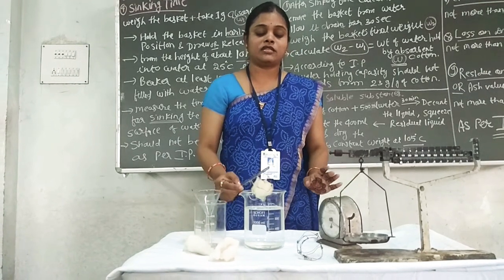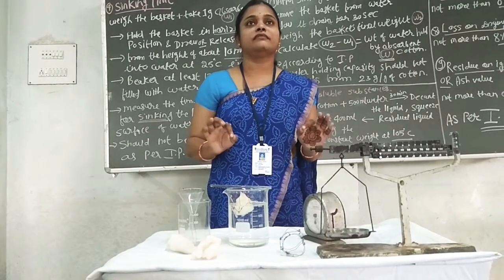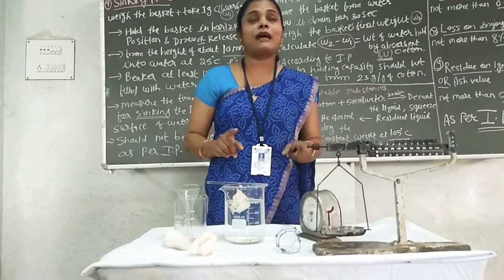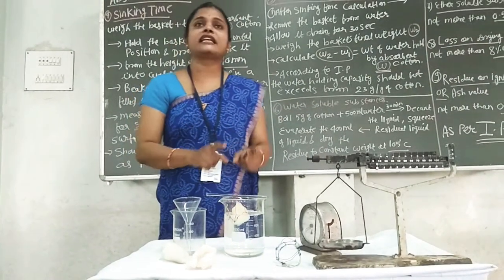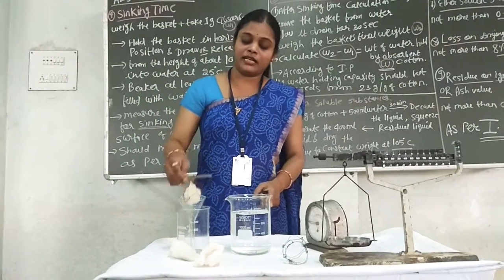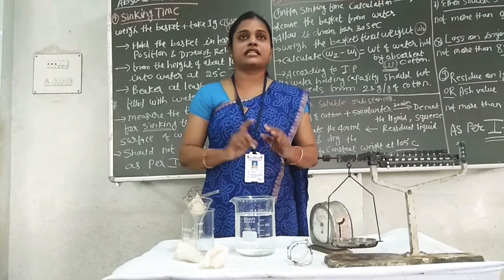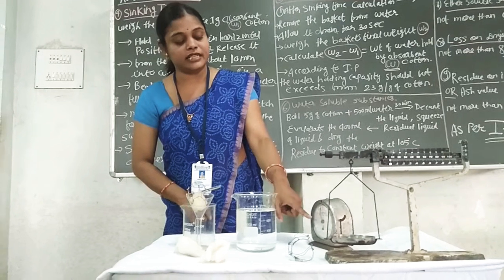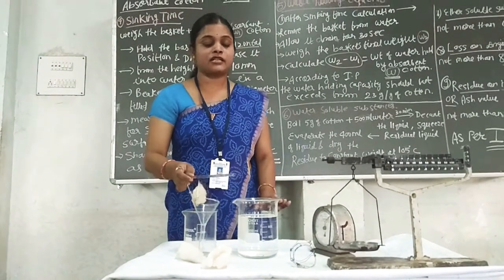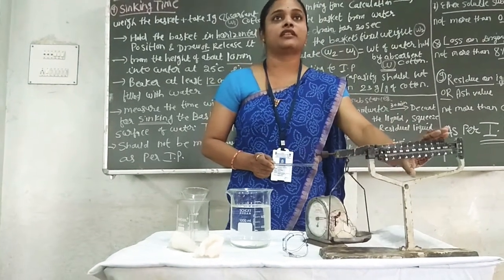For example, I have placed the basket. I will note how much time it takes to sink. This is the sinking time — for example, 10 seconds, 8 seconds, 11 seconds — these are example sinking time values. Now I will show the water holding capacity. I have filled it with water. I will keep it in position for 30 seconds so that the water drains out. After 30 seconds, I take the basket from the water and keep it in the middle to adjust its weight. This is my W2.